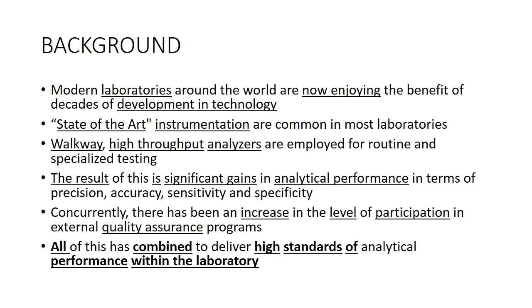Even in the post-analytical phase, you must have seen that manual data entry has been reduced now, at least in good, better equipped laboratories, because there is a robust IT framework, there is LIS, laboratory information system, so there is direct data transfer from machine to LIS. So manual data entry has reduced now, at least in big laboratories, right? So that part also is not so much prone to error.